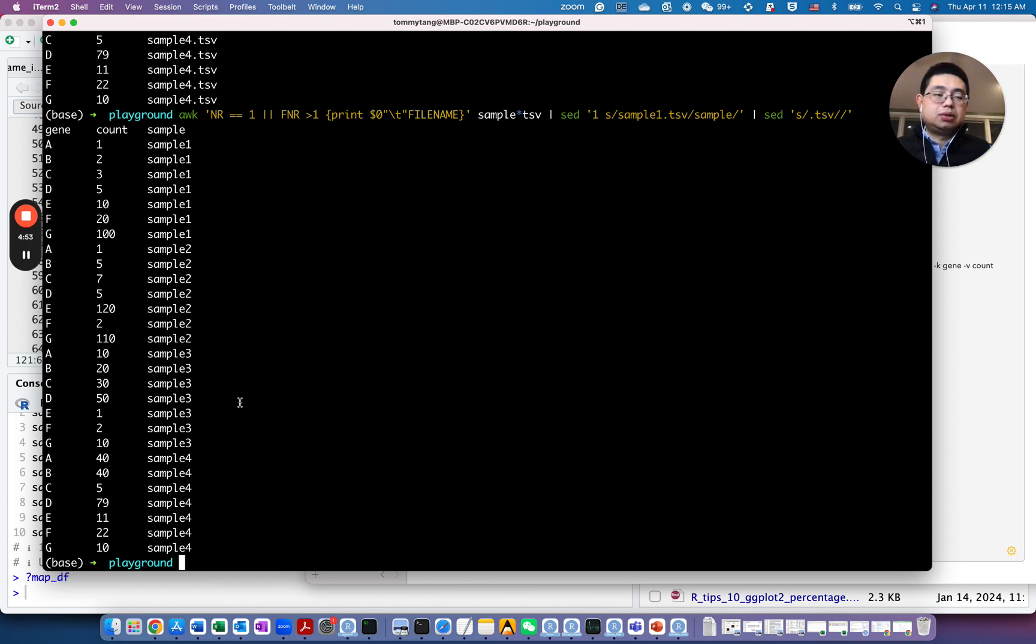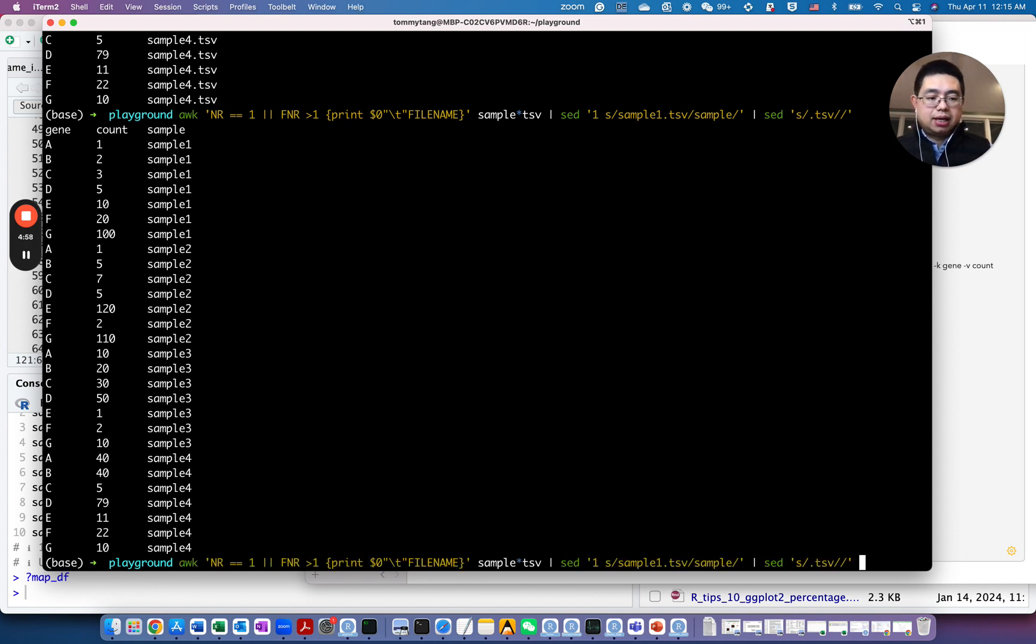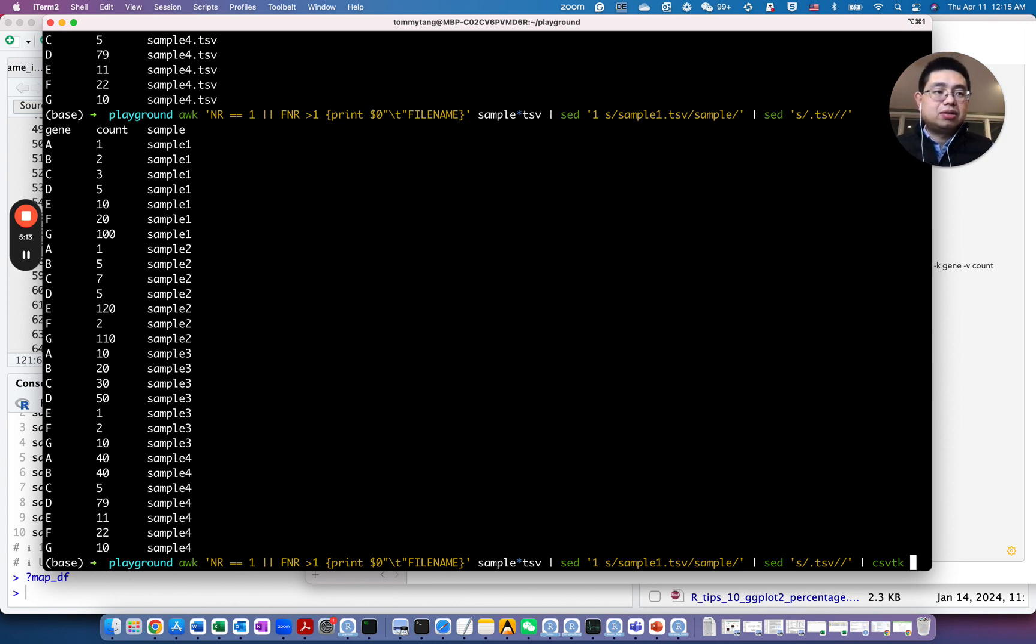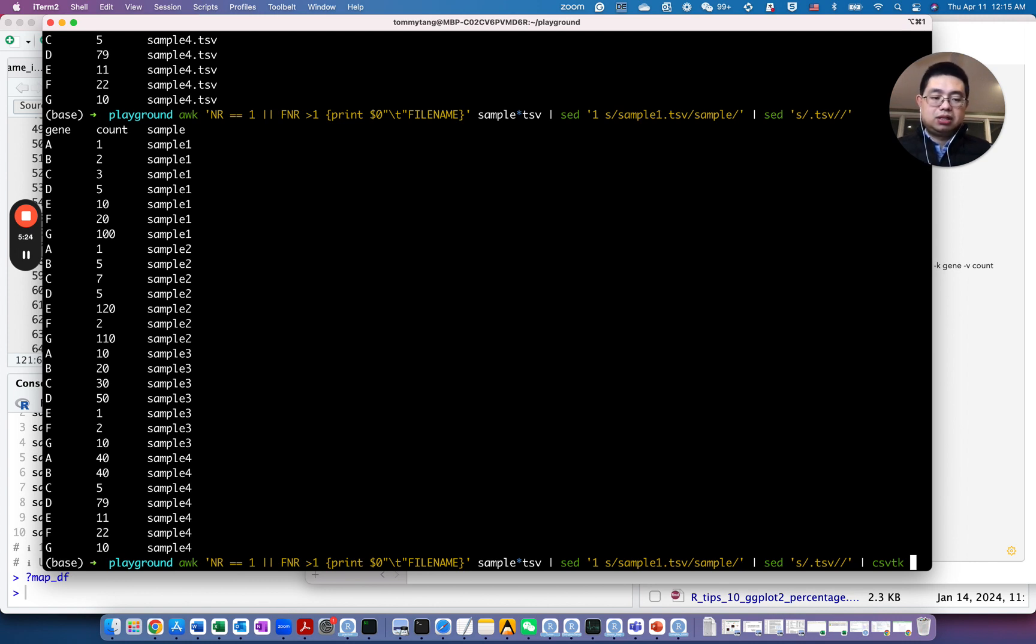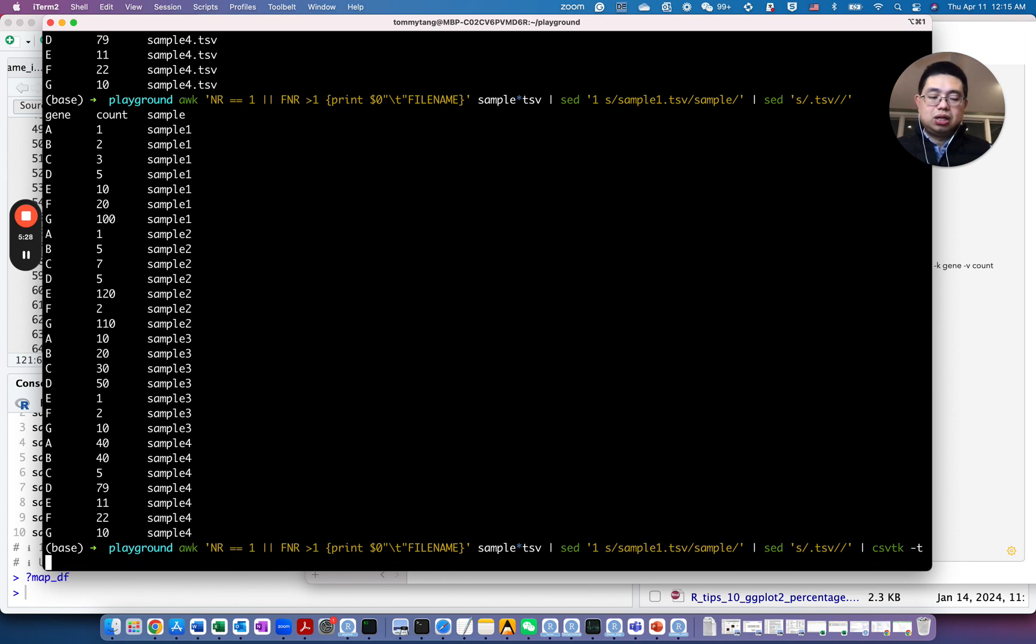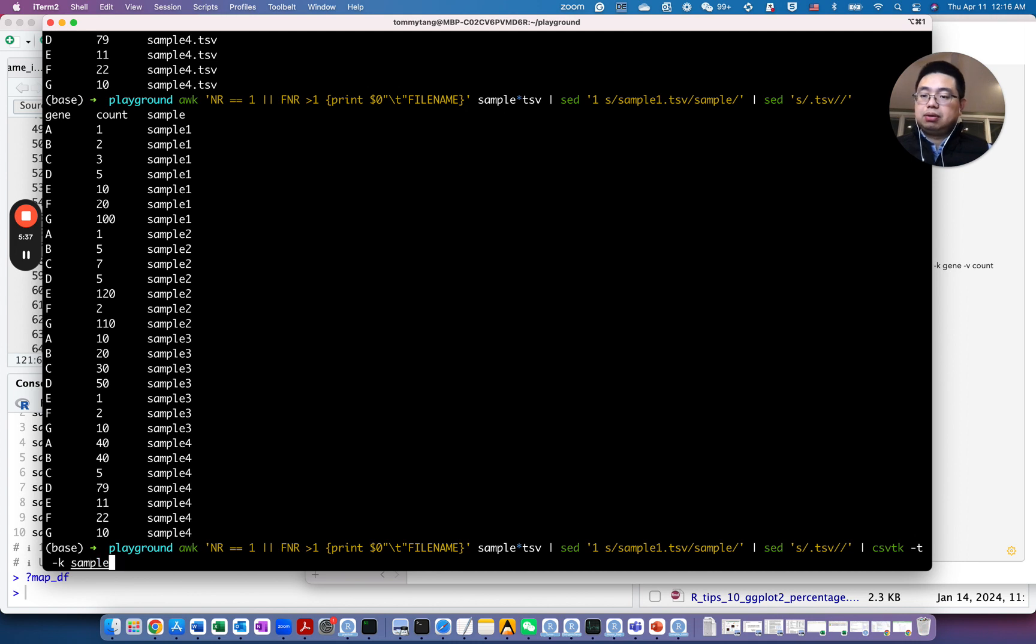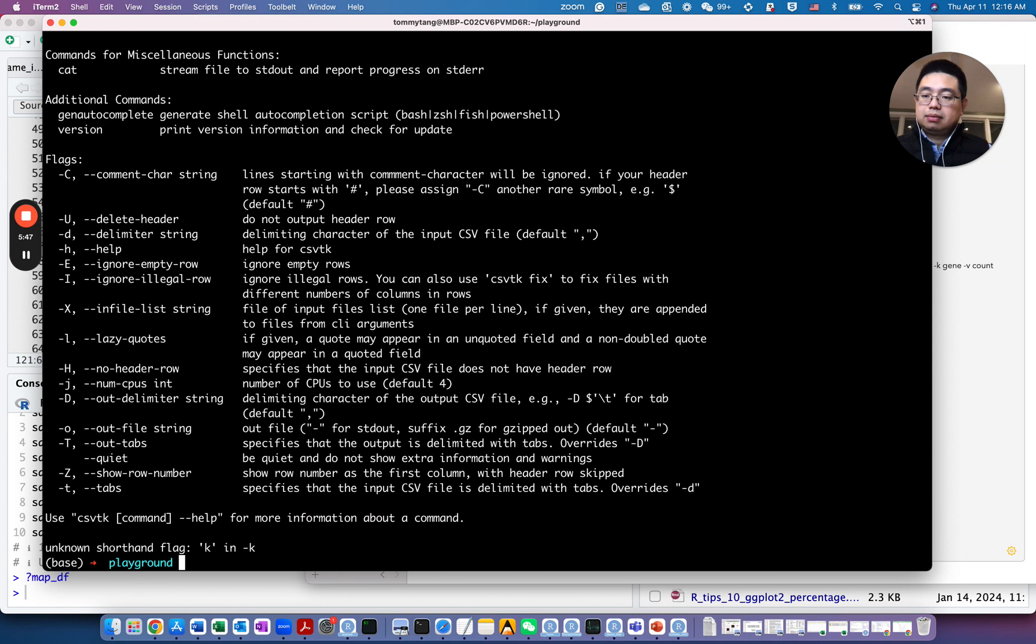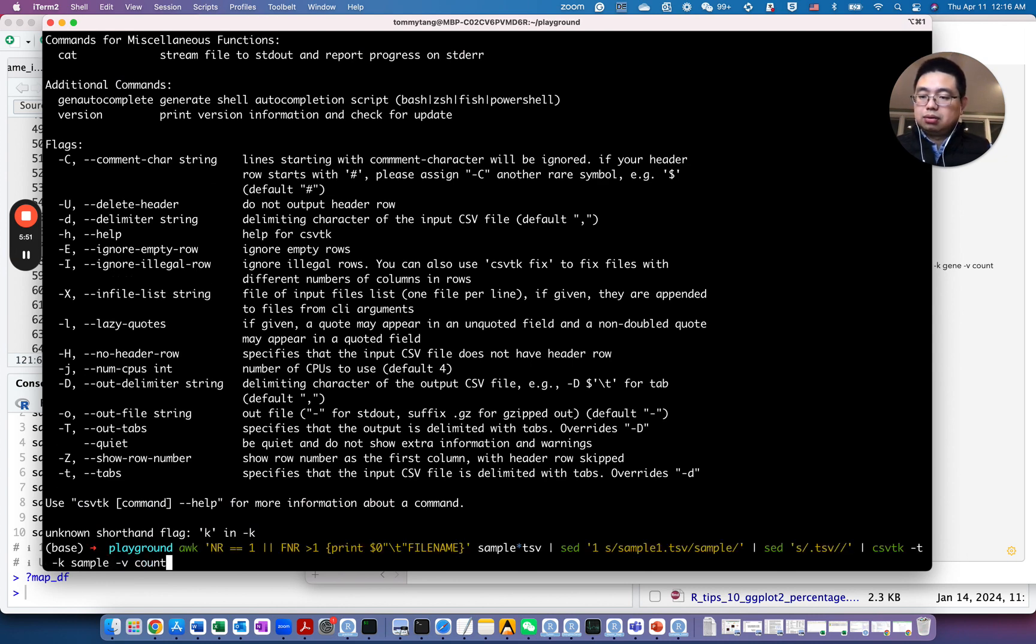You need to use this new tool called csv-tk. So actually, I introduced it before. It's a very powerful tool for wrangling tsv files in the command. So csv-tk has this spread and gather functions that are very similar to the gather and spread functions in tidyr package in R. So what you do here, you use csv-tk, and because it's a tab delimited file, you use -t. And then the key will be the gene, and the values will be from the sample. So essentially, those will be the column names, and then the values will be the count. Essentially, the gene counts. Let's see how it looks like.